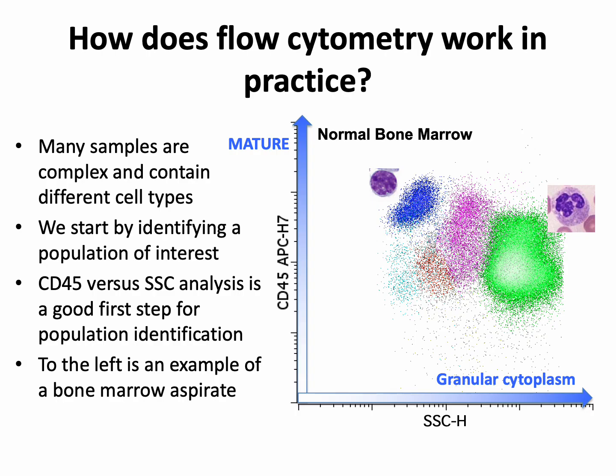So the level of CD45 you'll see in granulocytic populations in the marrow varies, with neutrophils having a higher level of CD45 than your promyelocytes. Now between the lymphocytes and granulocytic cells, shown in pink, is the region where the monocytes fall. They have high CD45 as they're mature cells, and intermediate side scatter.